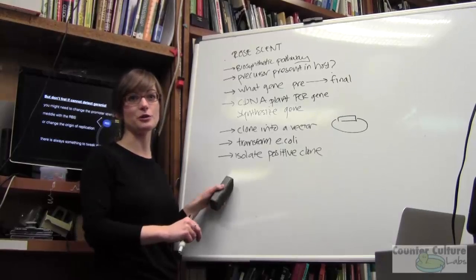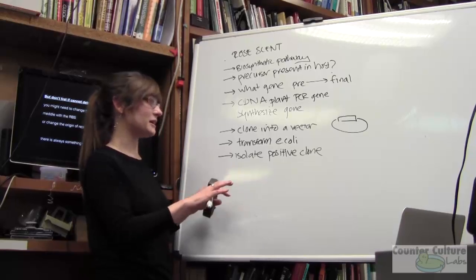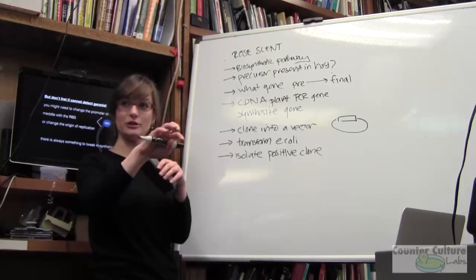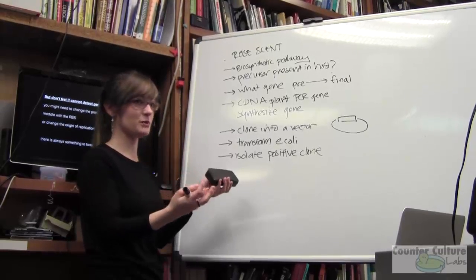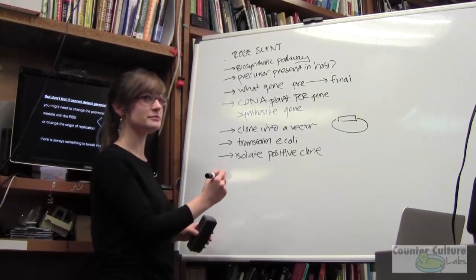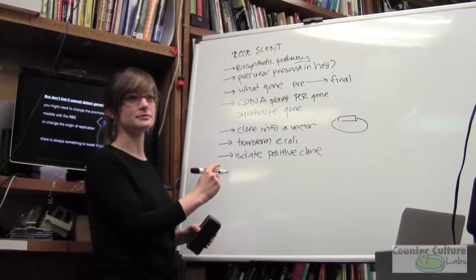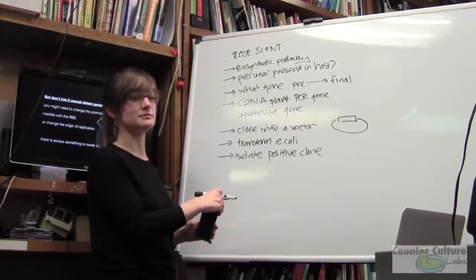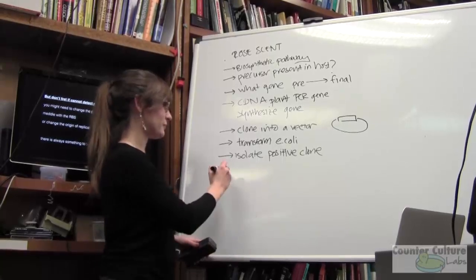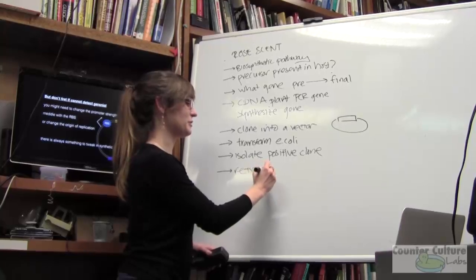If you want to put your positive clone DNA into a new vector, into a new strain, then you'd want to save your miniprep DNA and put it into a new host. Also, if you're putting a lot of pieces together, like you might want to sense something in the environment and have some logic to figure out what to do, and then have some reporter genes, you may want to try all of those separately and then transform them together. Absolutely. So maybe you're retransforming, maybe you're not, depending on your scenario. I'll put a question mark.